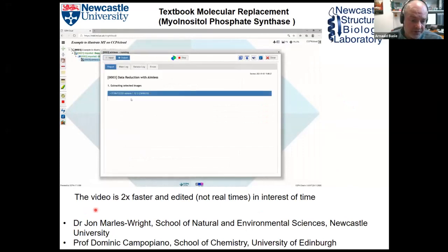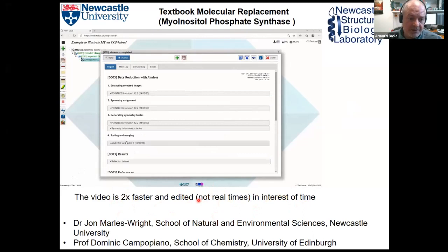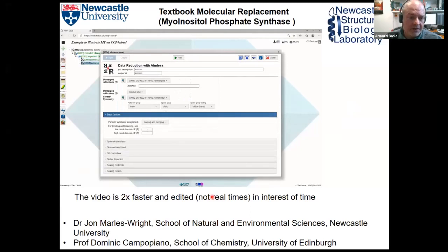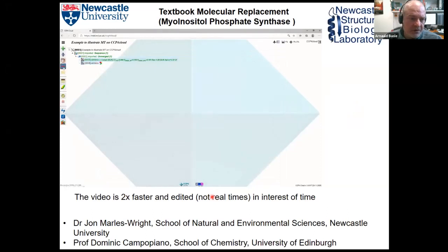I've sped up the video two times, and I also skipped parts, like here, in the interest of time. It takes slightly longer, but it's not too bad. In this case, my signal to noise may be a bit low to my liking, 0.8, as well as the CC half. So I will follow the guidelines and cut the data at 2 angstrom. For clarity and housekeeping, I just delete the previous task.